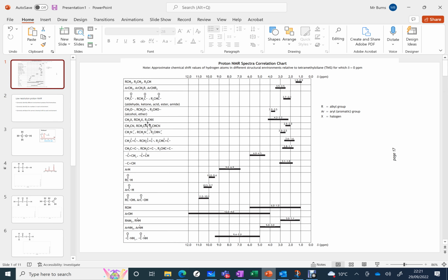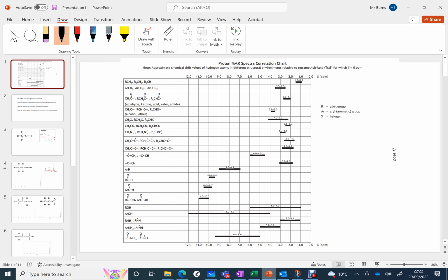Because when you start to look at these, right away you're seeing some functional groups in there. You can see the carbon-to-carbon double bond in here. You can see carbonyl groups up here near the top, etc. You can see OH groups down about here. So there's a lot of information being given in this, but you really need to know your functional groups.